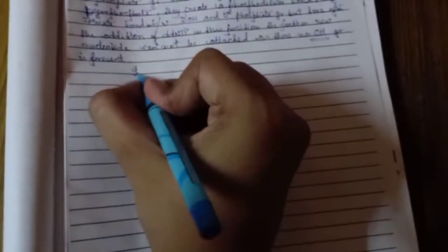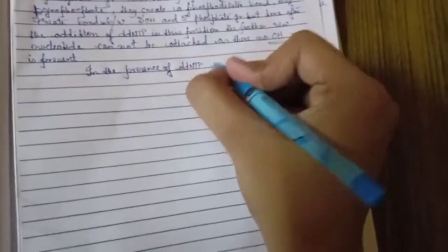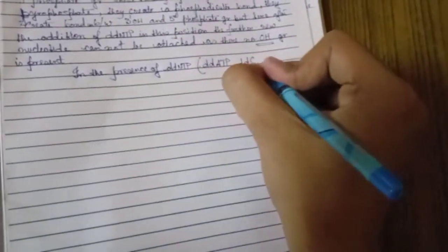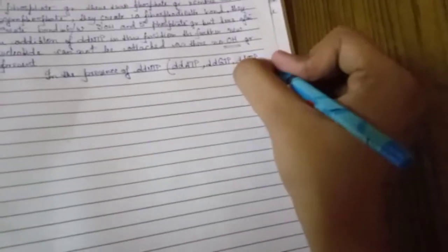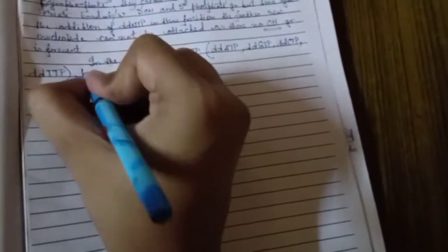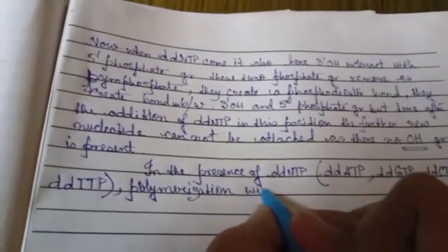In the presence of ddNTP, it may be ddATP, ddGTP, ddCTP or ddTTP, polymerization will stop because the ddNTP has no OH functional group in the 3' position.